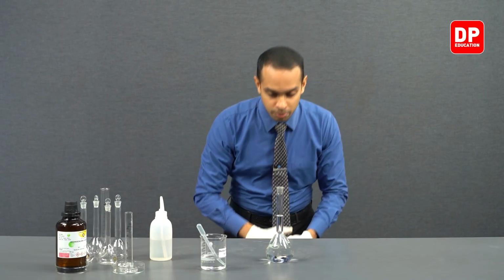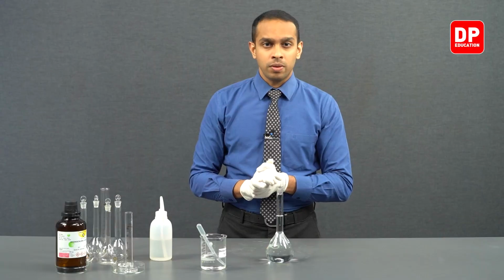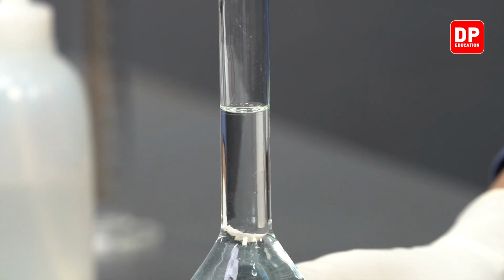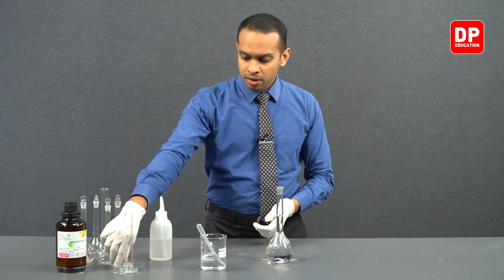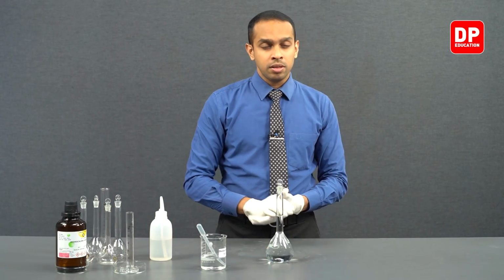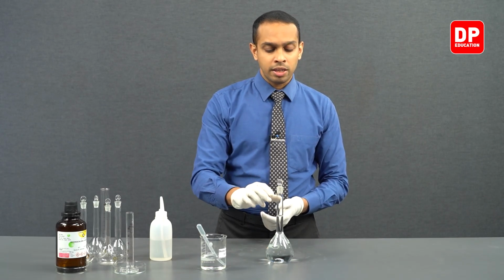You can place it on the table as well and observe that the bottom of the meniscus aligns perfectly with the calibration mark, indicating that we have now added the correct volume of water to this solution.